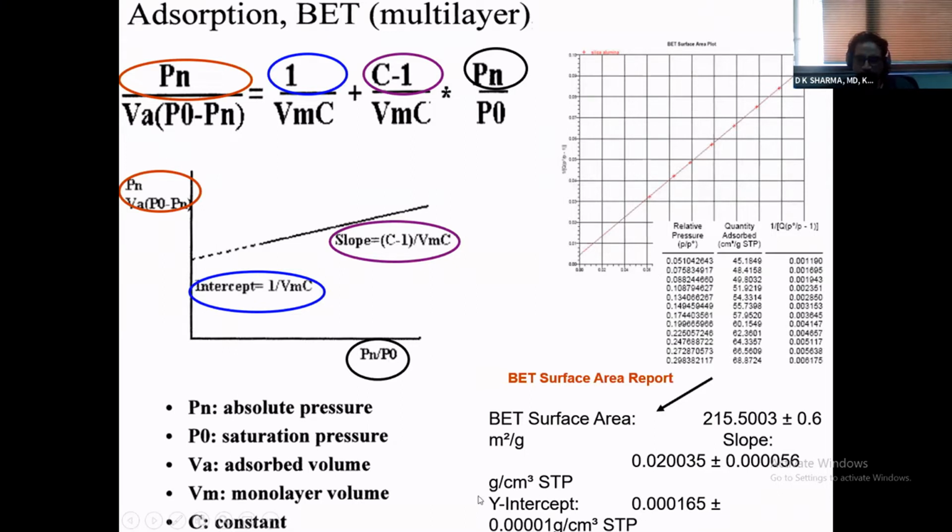It will also tell you what the y-intercept would be. This equation has to cut the y-axis on the positive side. So this small thing is the y-intercept. This needs to be positive. C has to be positive.